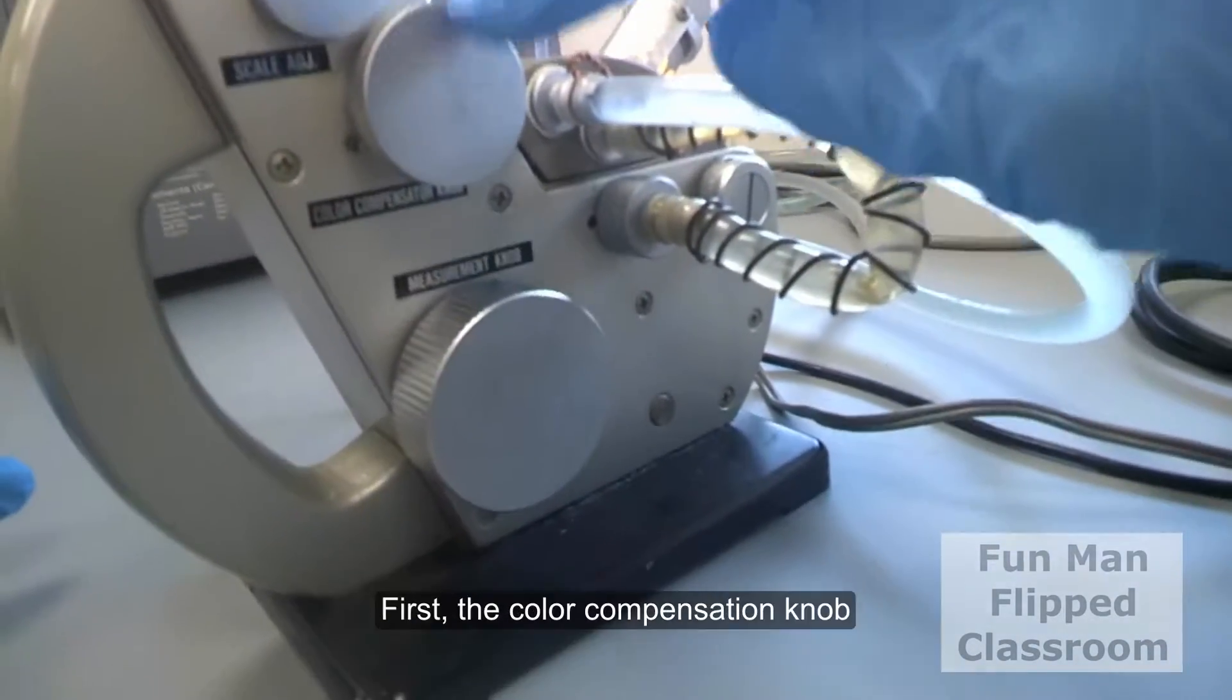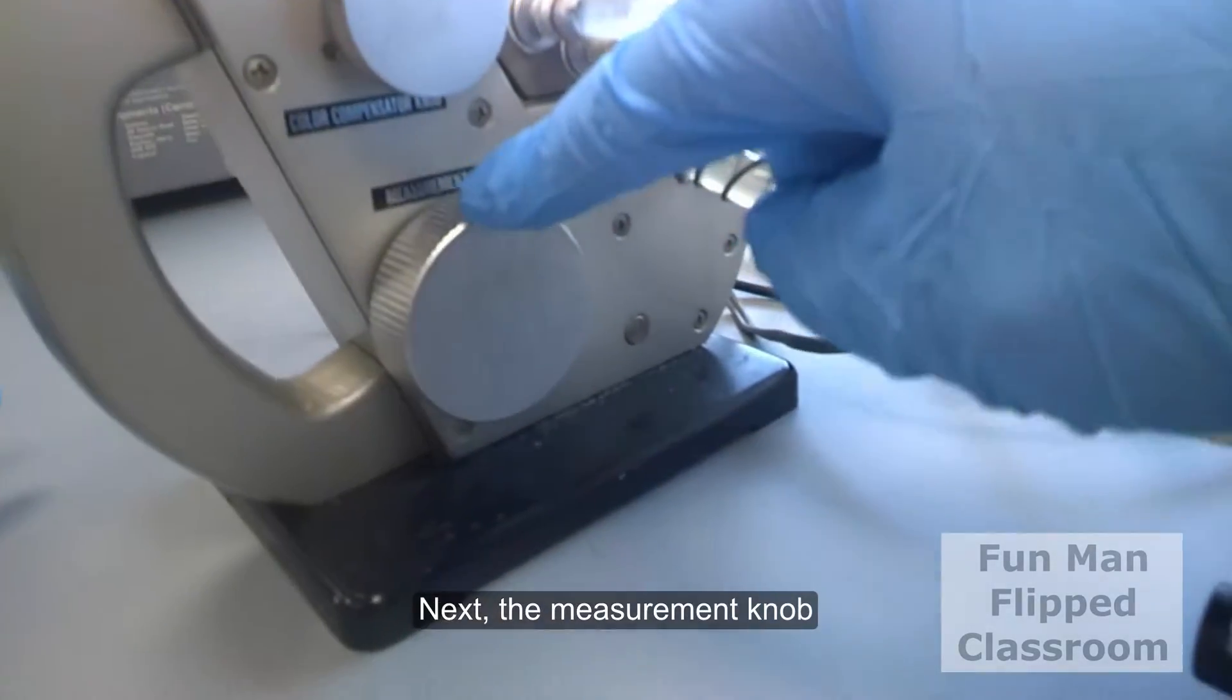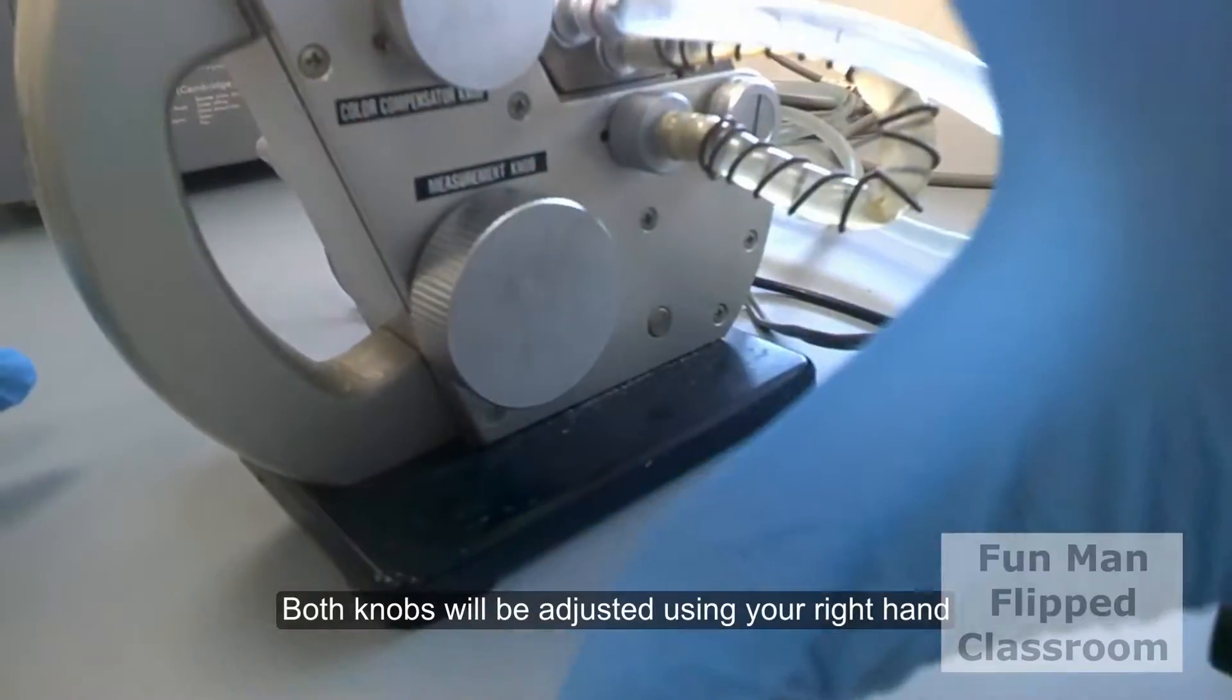Now first, the color compensation knob. Next, the measurement knob. Both knobs will be adjusted using your right hand.